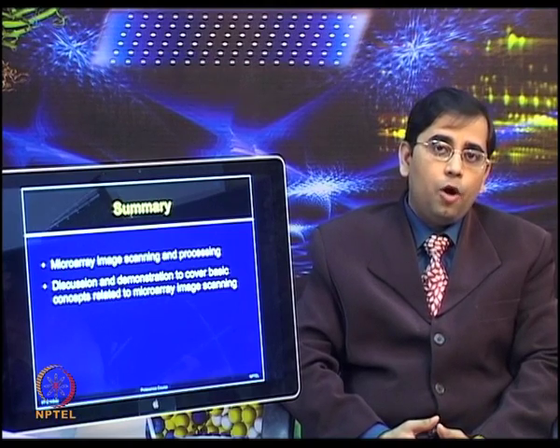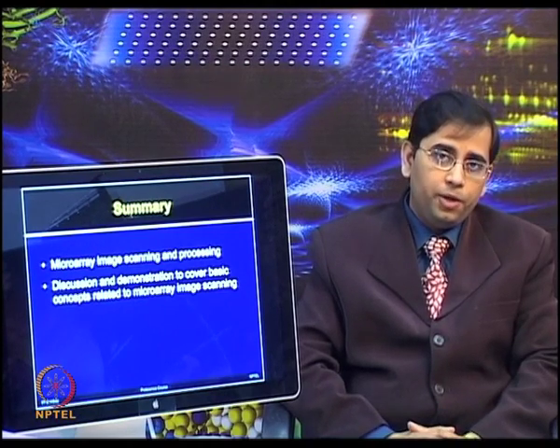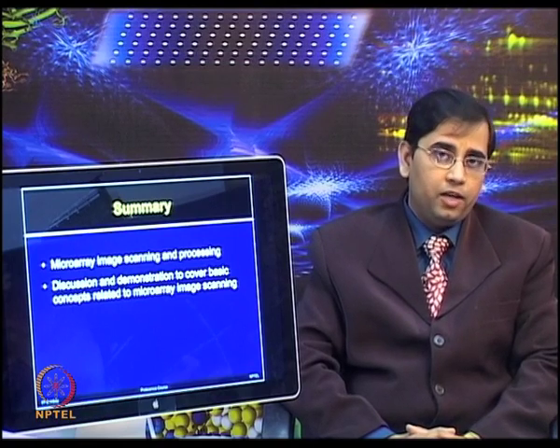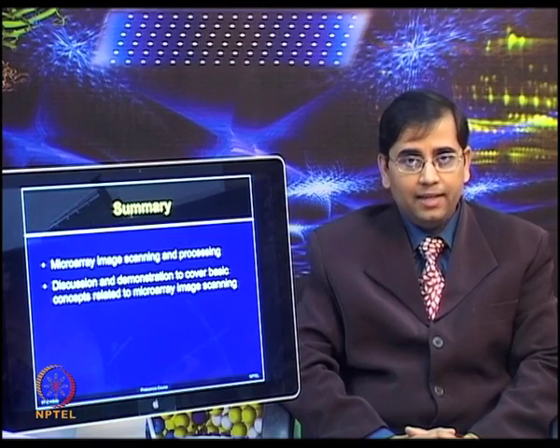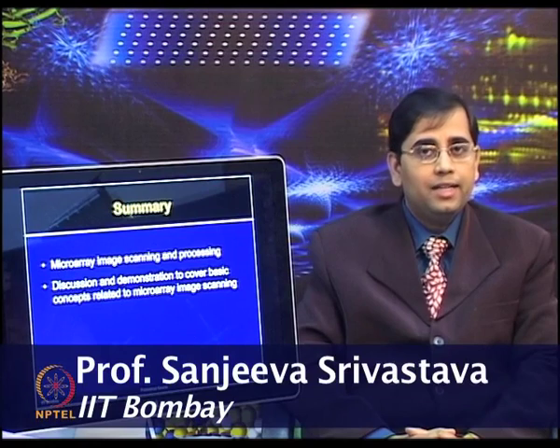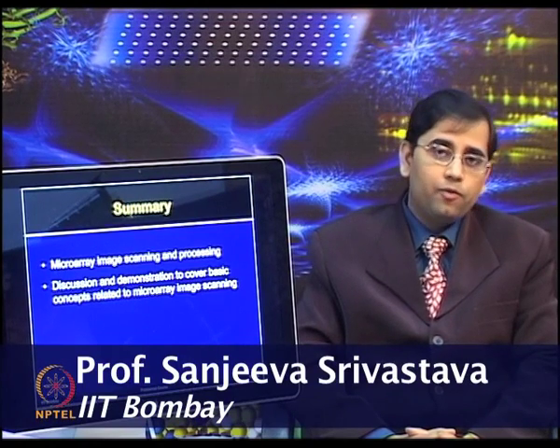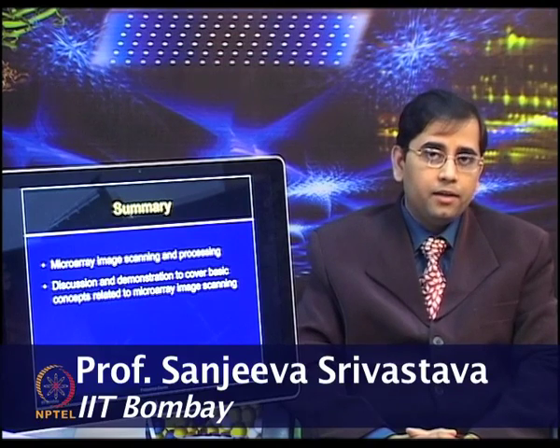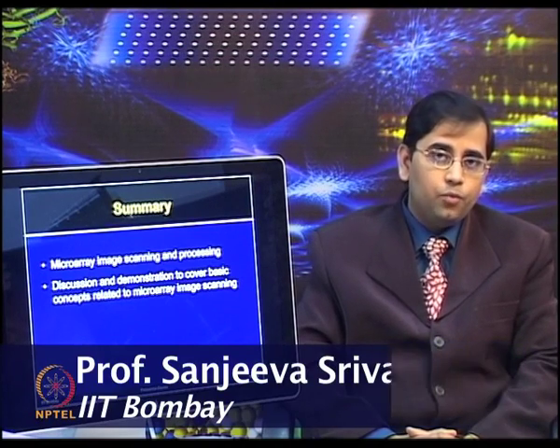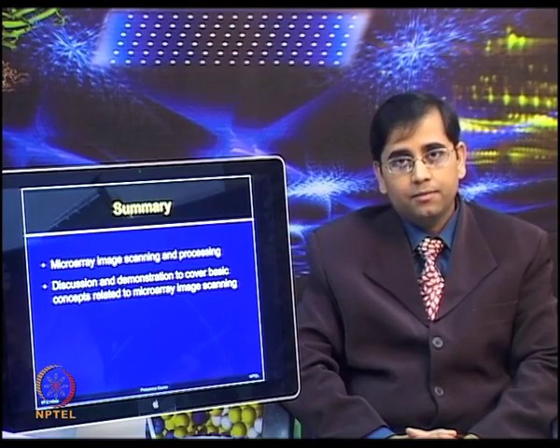Before you can obtain any biologically meaningful information, you need to very carefully process the image and then perform the data analysis. In the next lecture, we will continue our discussion on the microarray workflow and how to analyze the microarray data obtained from these images, which we have discussed in today's lecture. Thank you.